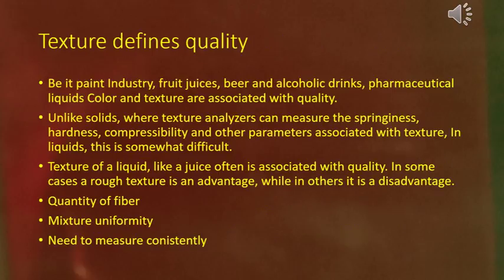Texture defines quality perception. Be it paint industry, fruit juices, beer and alcoholic drinks, pharmaceutical liquids, color and texture are associated with quality. Unlike solids, where texture analyzers can measure the springiness, hardness, compressibility and other parameters associated with texture, in liquids, this is somewhat difficult. Texture in liquids is a more physical or visual property.